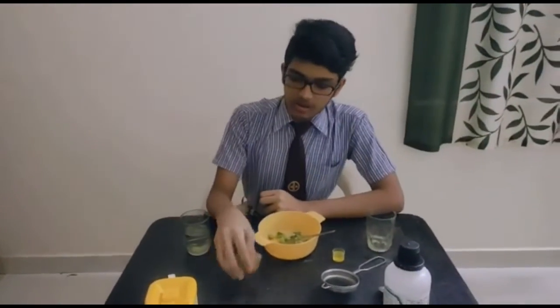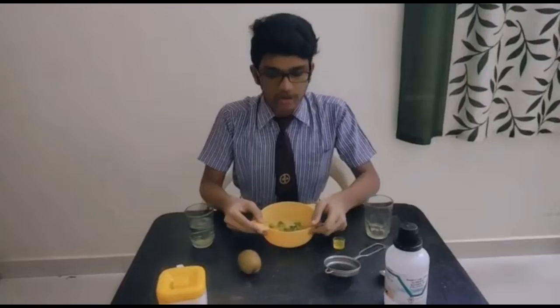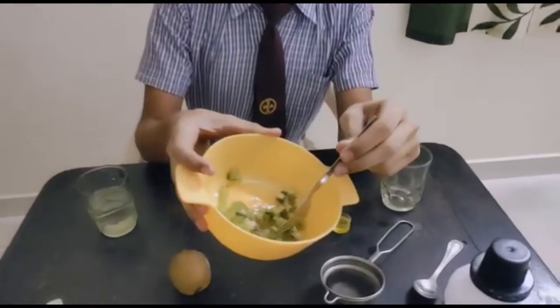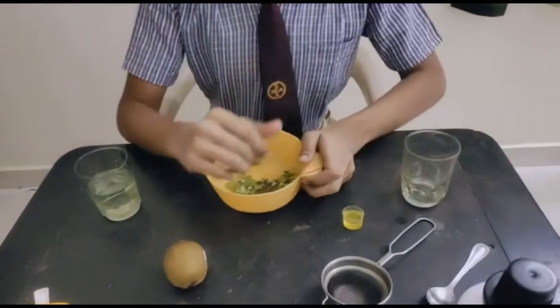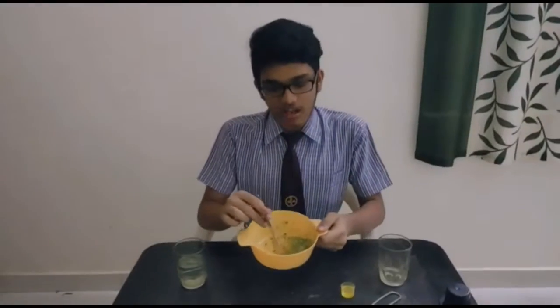First we should dice the kiwi into smaller pieces. Here I have already diced it into smaller pieces as you can see here. Next step is that we should mash it — so now I have mashed it here.